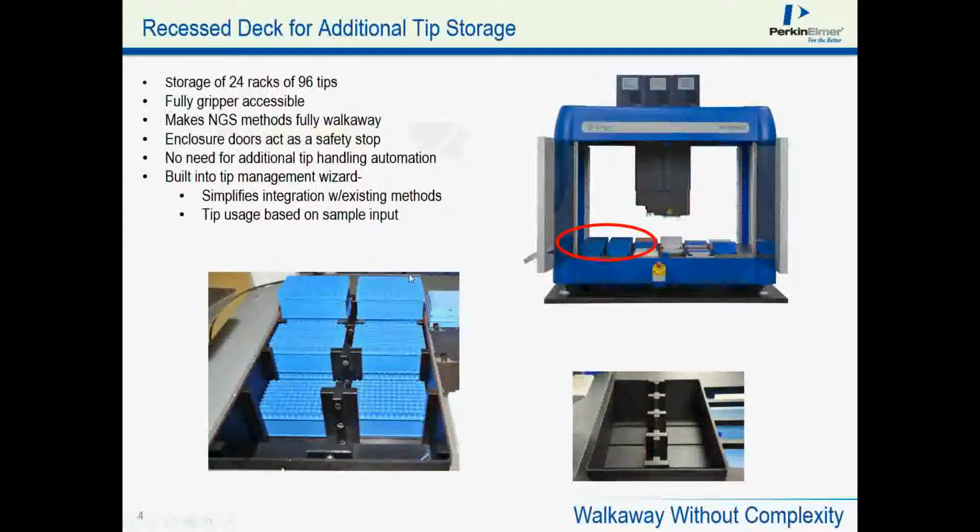And this particular slide goes over a little bit more, a close-up picture of that recessed deck that we actually store our reserve tips. And again, you can hold up to 24 tip boxes. And over here on the bottom right corner, this shows, if it was empty, what it looks like.